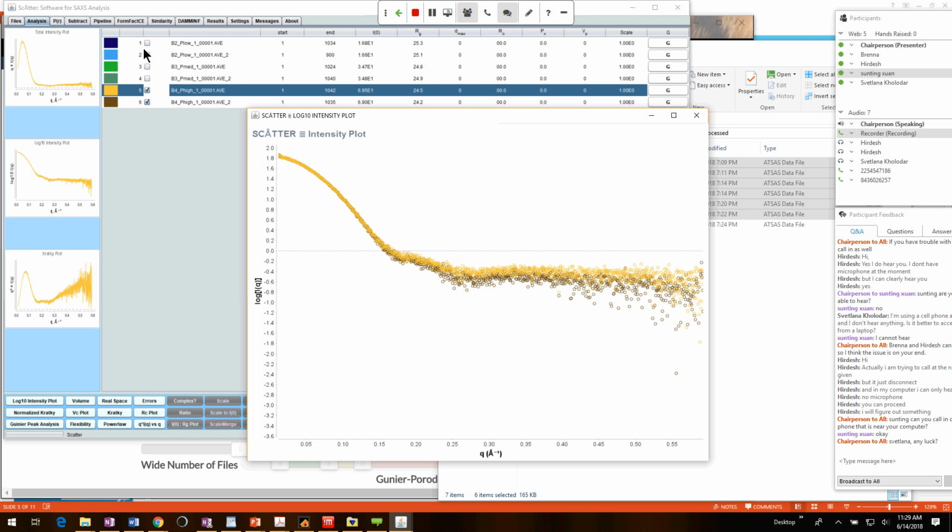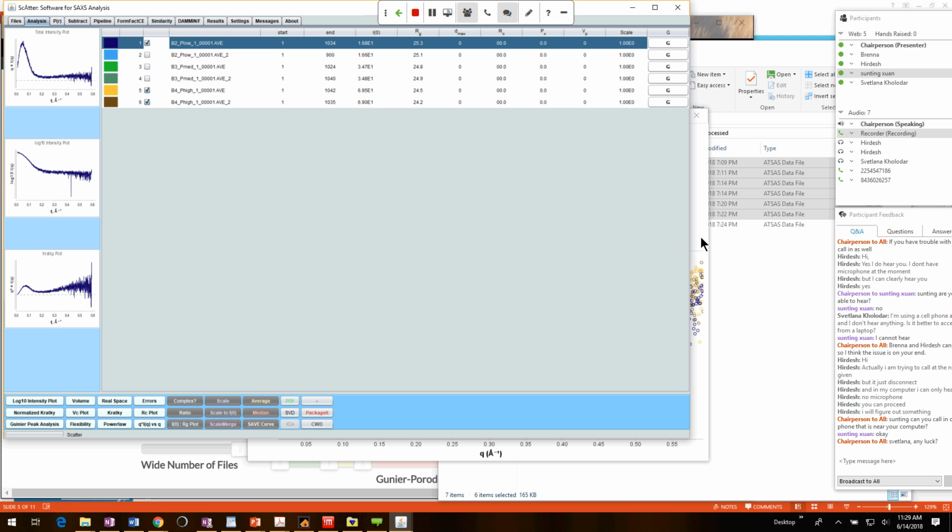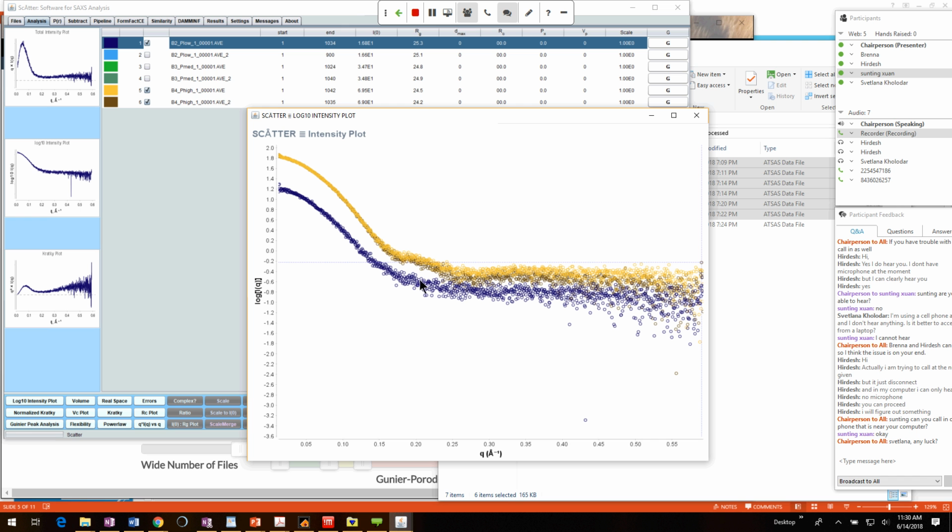So in the low concentration, you really can't see that bump very well. It's just in the noise somewhere, but it comes out nicely in the higher concentrations. So that's a nice place to pause and ask for questions. I'm going to push further in the analysis from here, but this gives you, up till now, how to get your primary curves. Any questions?